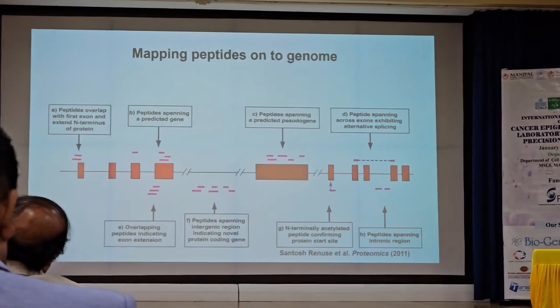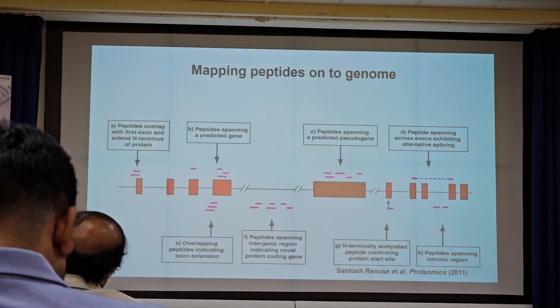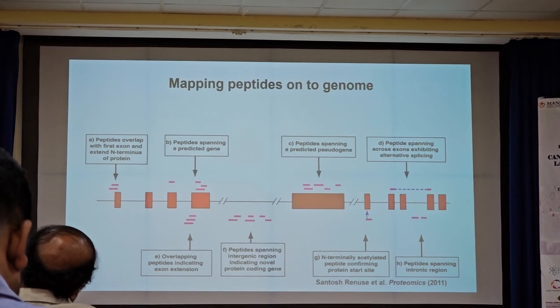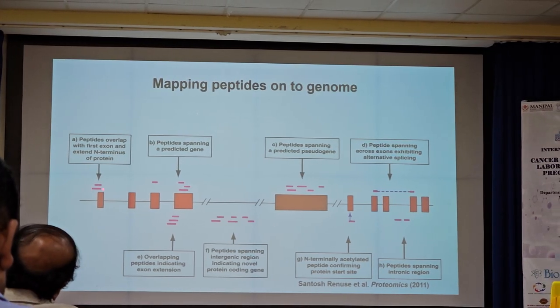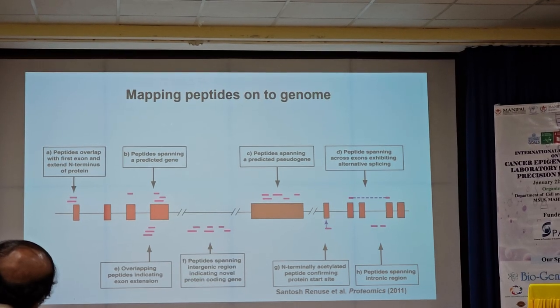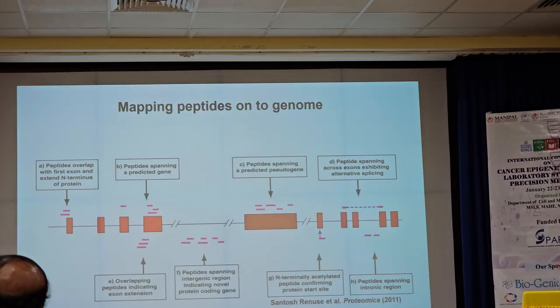All the proteins which are there in the database are conceptually derived from the genome through computational approaches. So when you detect a peptide from the mass spectra, it is reasonable to tell that this is the real structure of the protein, and you redraw the protein annotation. This is called proteome-driven genome annotation.